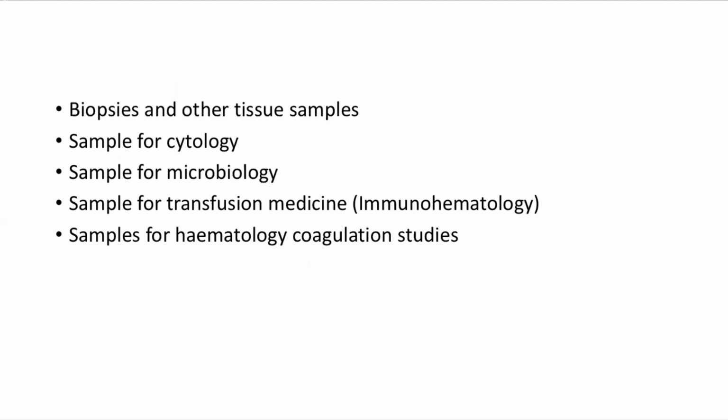They are collecting biopsy sample. Biopsy sample may be for routine hematoxylin eosin, or some special stains may be required. Immunohistochemistry, cytogenetics, electron microscopy, certain translocations, next generation sequencing, microarray. So many tests are there. So how these samples shall be collected, transported. For this, a regular interaction between clinician and laboratory people is very important.